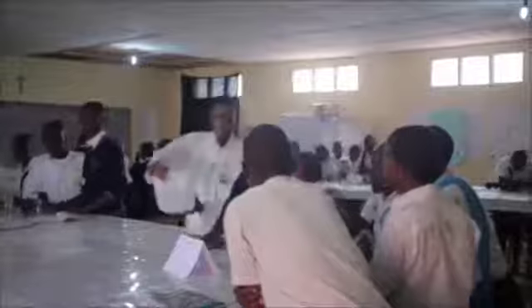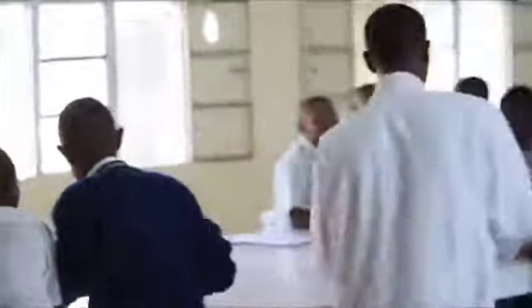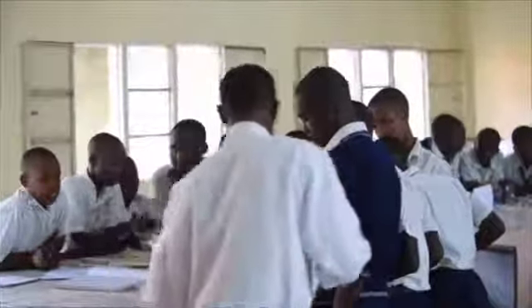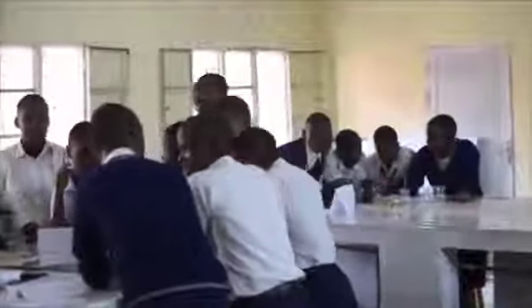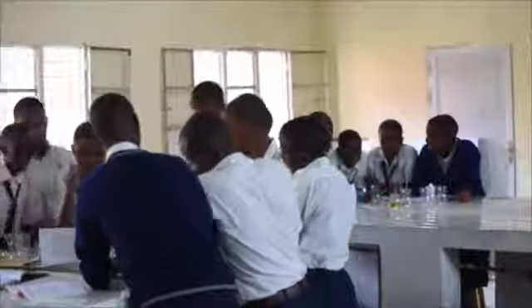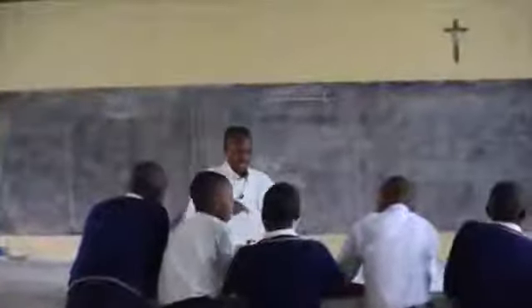It's from banana beer? From banana beer. In our lab, we have tried to separate or to remove ethanol from banana beer. All of you have ethanol? Yes. Very nice.